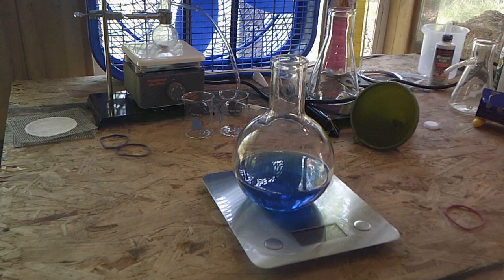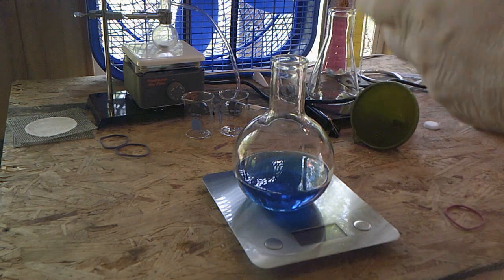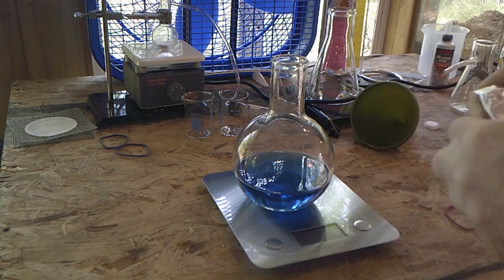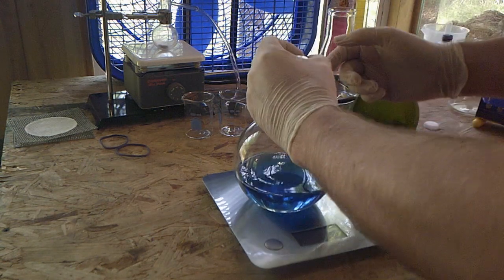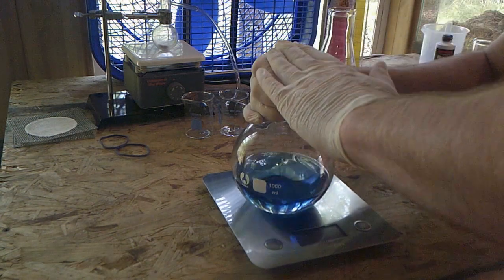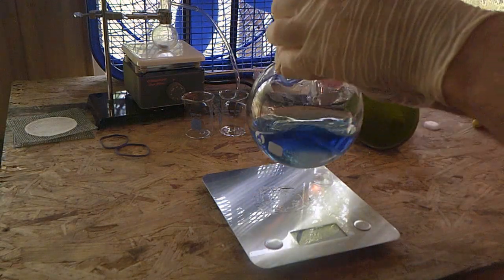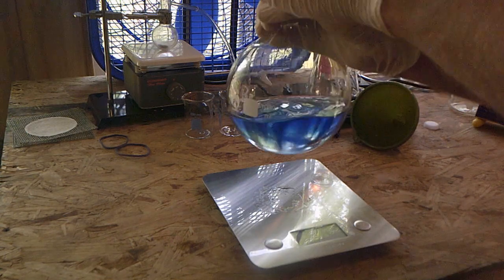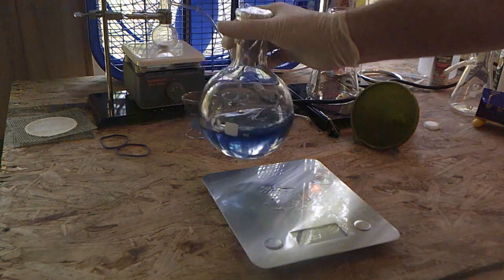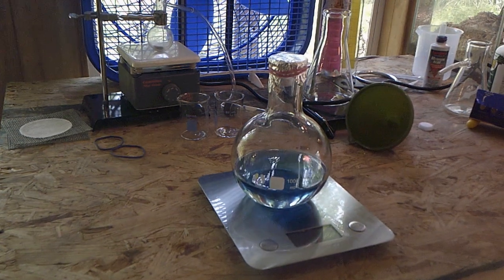I'm going to make a little cap because I couldn't find the caps that I usually use, my stoppers. So we're going to use aluminum foil to make a cap to go over the top. Alright, and now as I let that sit there, I can already see it beginning to change color. Hopefully you guys can as well. Let's go ahead and zoom in.